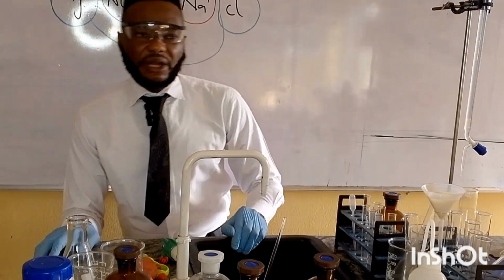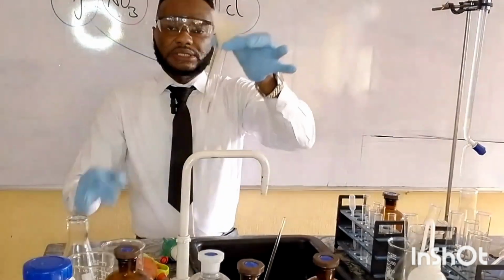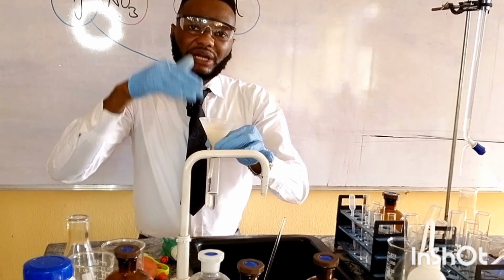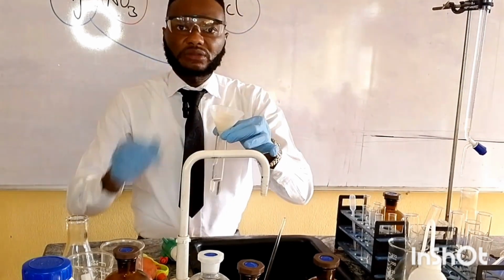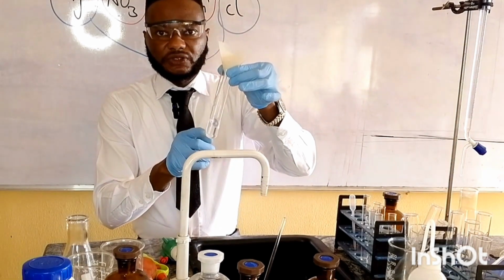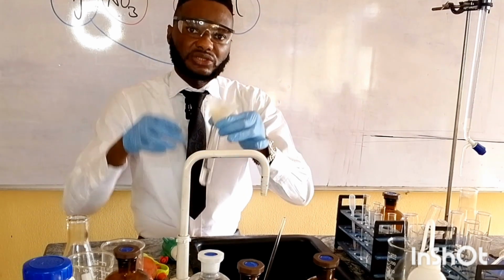Okay guys, I believe our filtration process is complete. So this is our filtration process. The liquid that passed through the filter paper is called the filtrate. So this is our filtrate. While the particles left on the filter paper after filtration are called the residue.